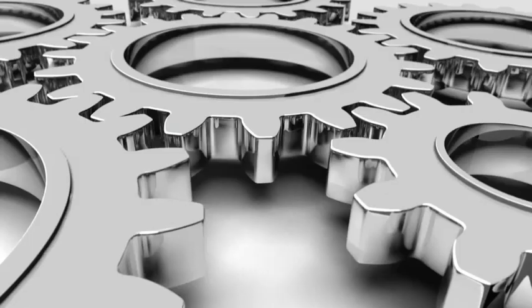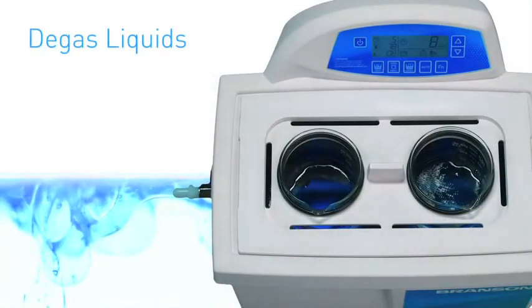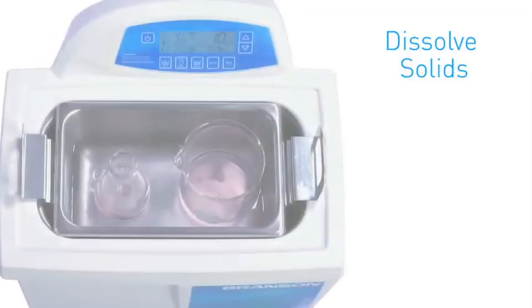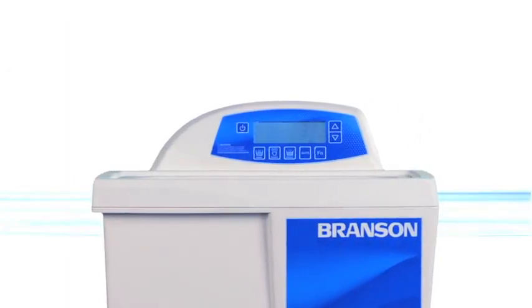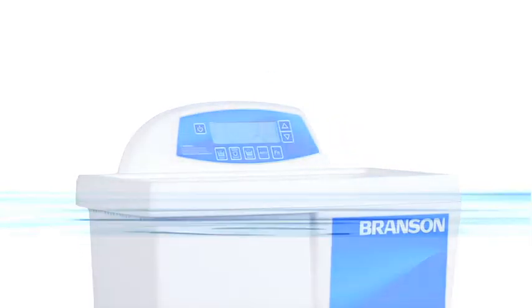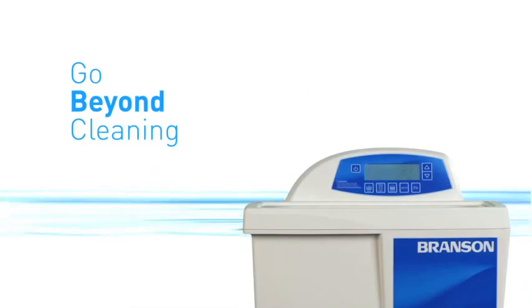At Branson, we're more than ultrasonic baths. We're going beyond cleaning, like sample preparation, which includes degassing liquids, mixing and homogenization, dissolving solids, cell lysing, and dispersion of particles. From our innovative self-adaptive technology, to flexible programming, to a variety of sizes to accommodate a host of applications, we've reimagined what it means to clean with precision. Are you ready to go beyond cleaning?